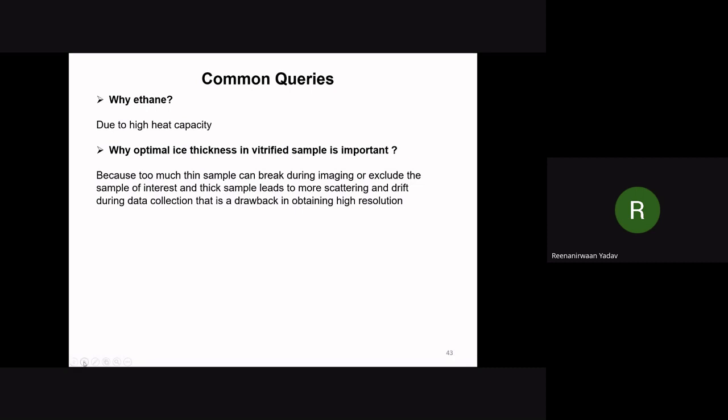Another reason is that liquid nitrogen forms a condensed, very cold layer over it. Whenever we dip our sample inside the nitrogen, it may condense before plunging, which may lead to the formation of crystals, and we can destroy our sample.